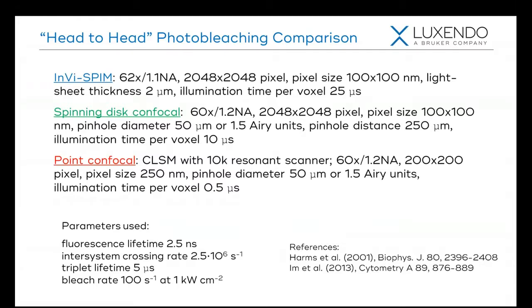To give you an idea of the photobleaching in comparison to techniques like spinning disk and point scanning confocal, we've set up a quote-unquote head-to-head photobleaching comparison.